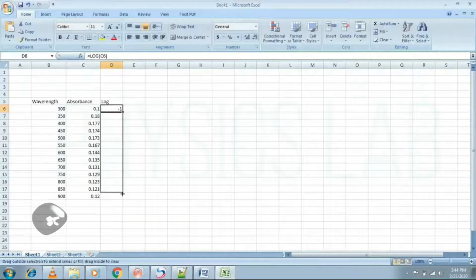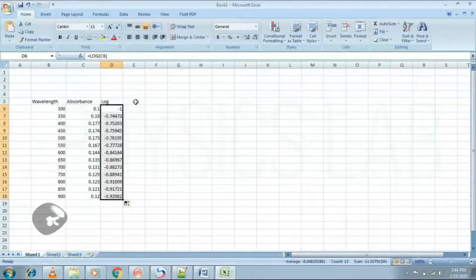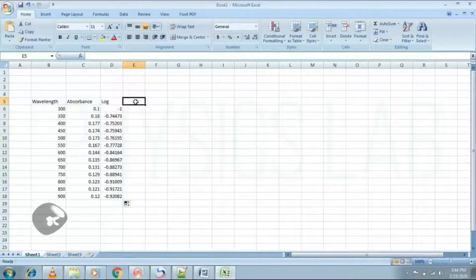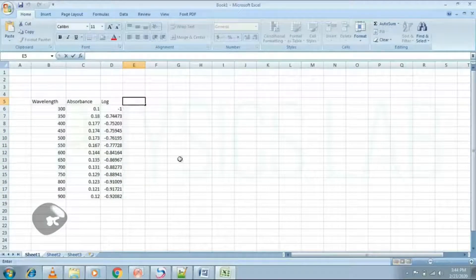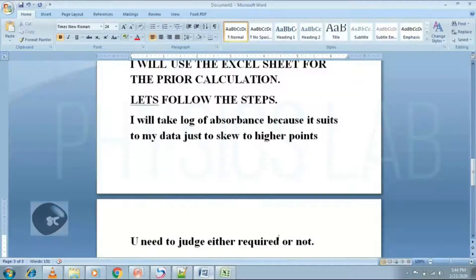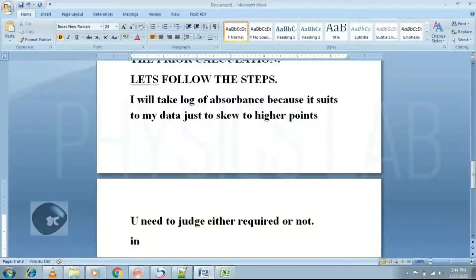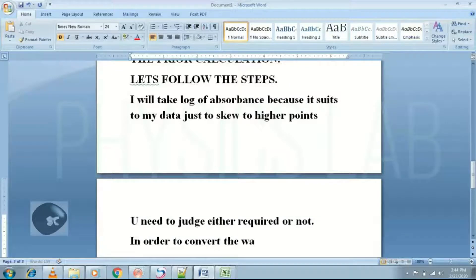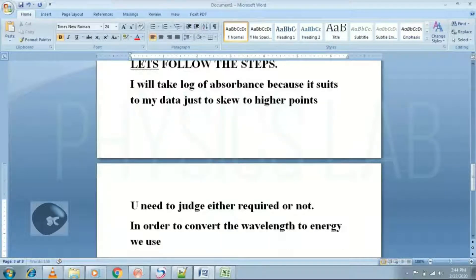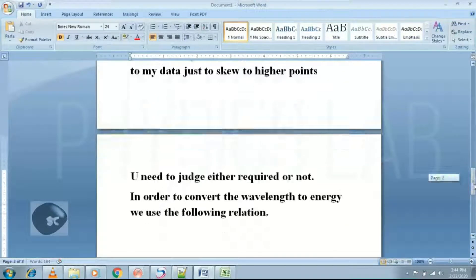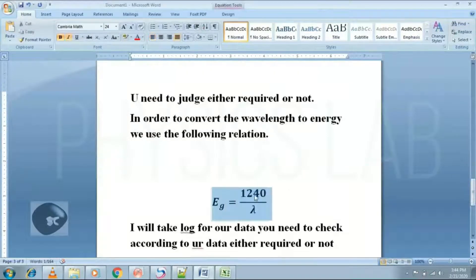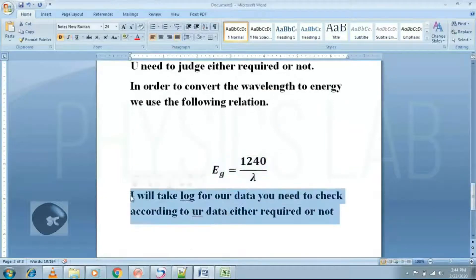Taking log is optional. Step 1: Convert the wavelength into energy.